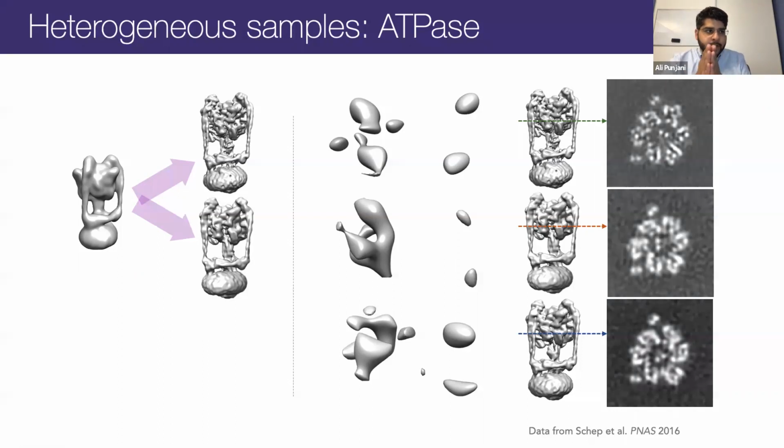The central stalk rotates between them in a continuous sense, but in terms of the energy landscape, we're extremely likely to find a particle in one of the 3 positions and not in between, at least when the protein is inactive and not actively rotating. So because of that, those different conformations are discrete conformations, and we can separate them easily, and each one we can treat, once we have found the particles, as a homogeneous, rigid object. There's just 3 variants of it. That's not the model that we want to go forward with, though. And it turns out even on this data set, there is lots of interesting flexibility that happens in the molecule that we can now resolve.